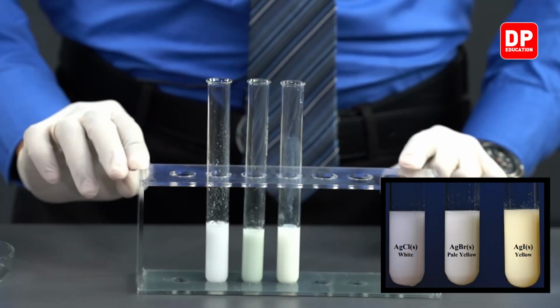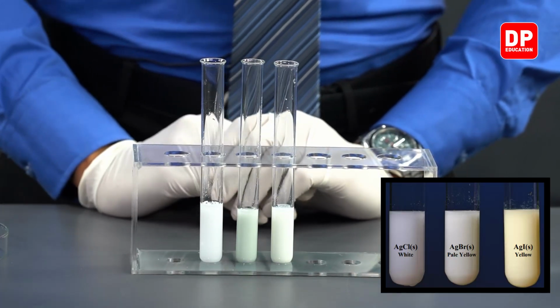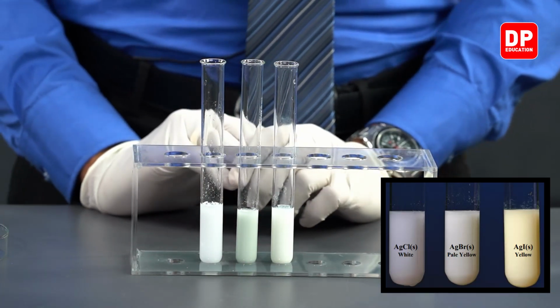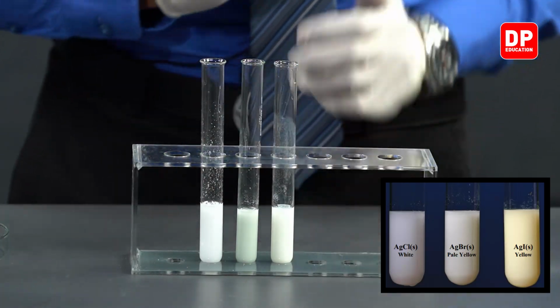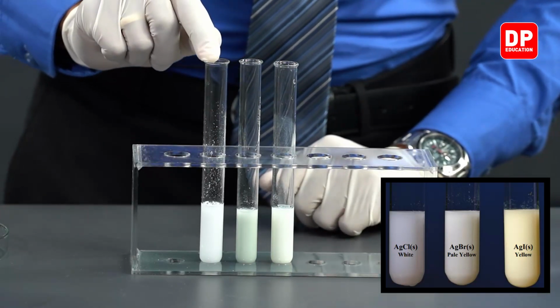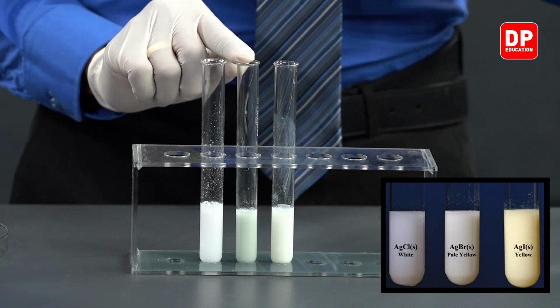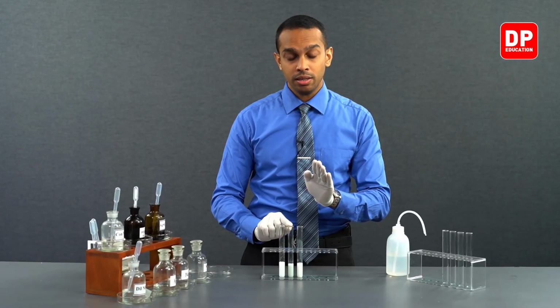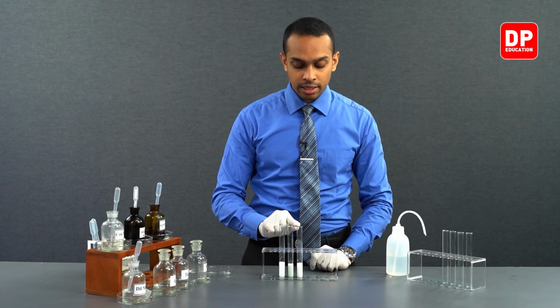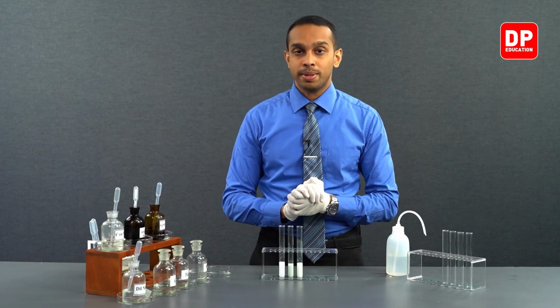Now when you have all three compared against each other, you will be able to see the slight color variations of the three precipitates. Silver chloride being white, silver bromide having a pale yellow color, and silver iodide having a yellow color precipitate.